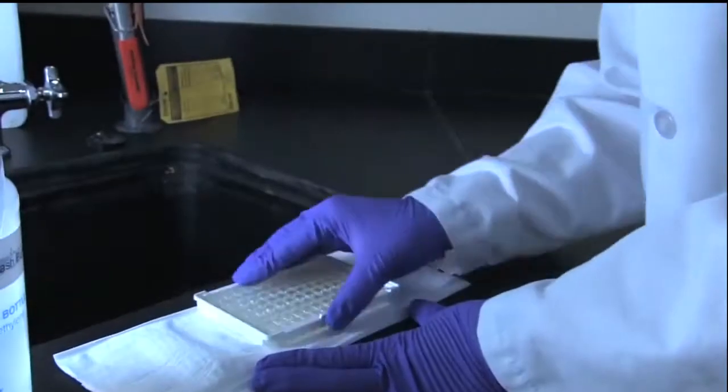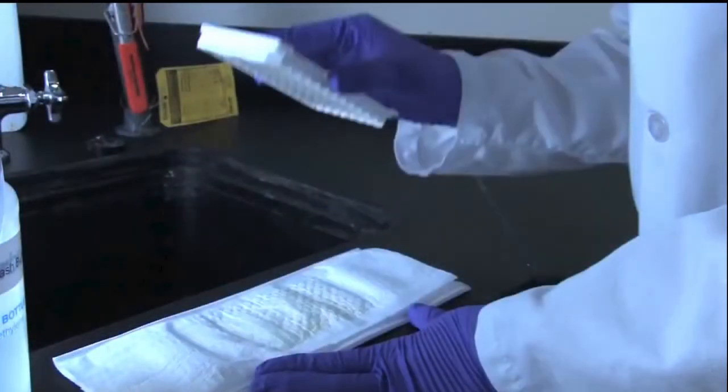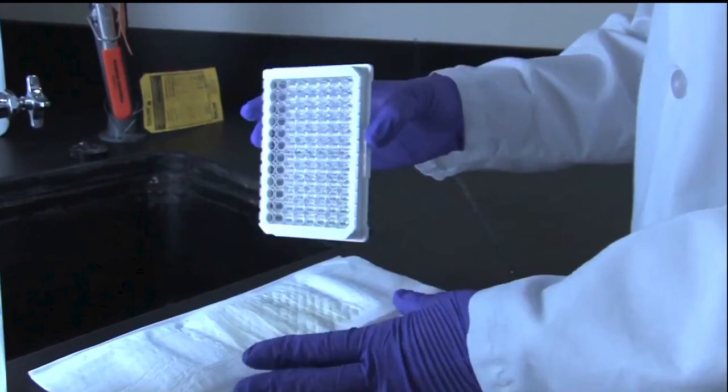Tap the inverted plate on a dry and lint-free absorbent surface, such as a Bounty paper towel, to ensure all liquid content has been removed from the wells. Blotting towels should be changed frequently.